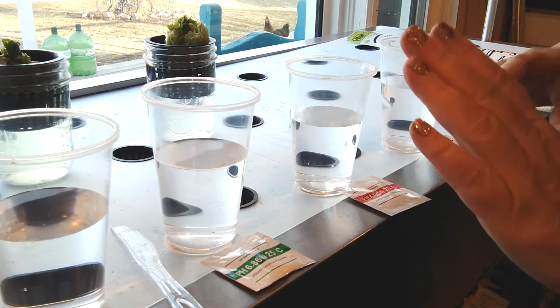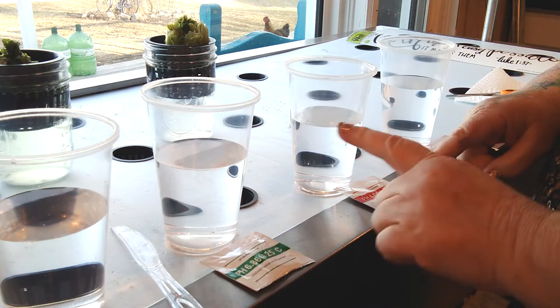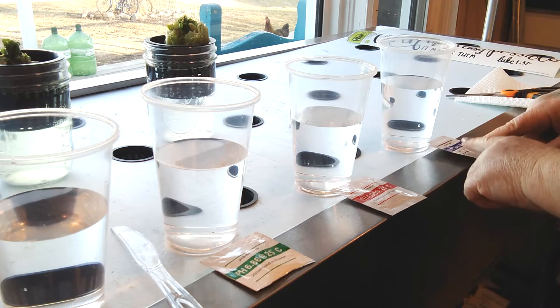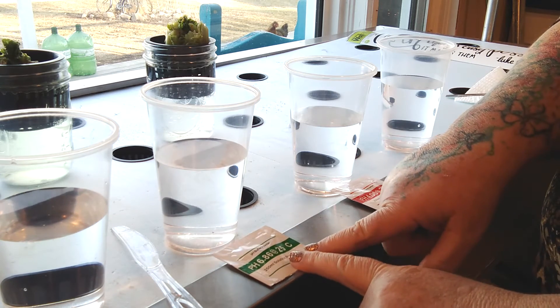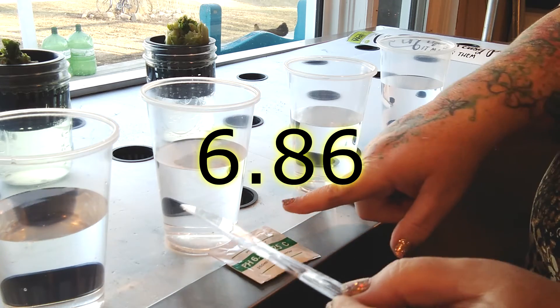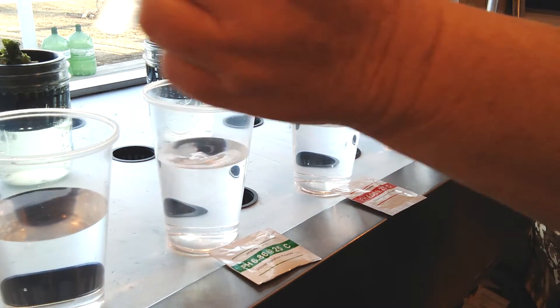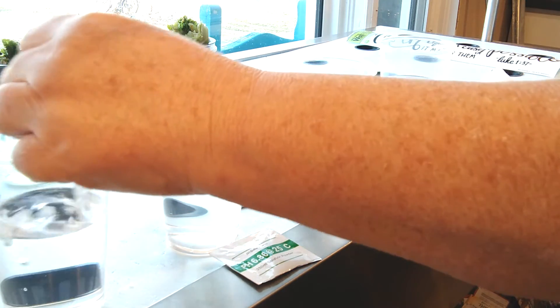This has to be done in a specific order: it has to be 6.86, 4.0, and then 9.18. Starting here on the left we have our pH 6.86. I already have the solution in my cup. I'm going to give it a stir — you want to stir it until all of the solids are mixed.